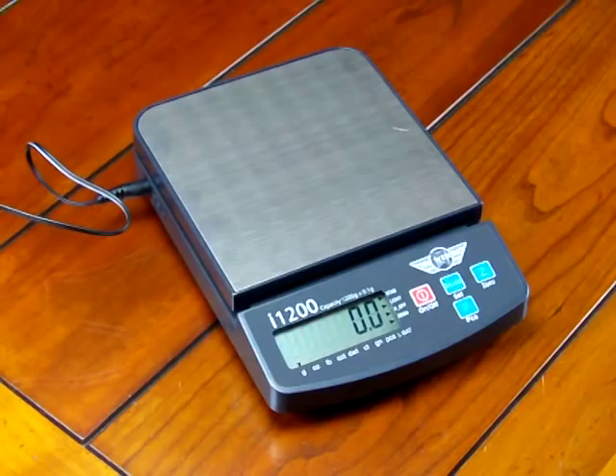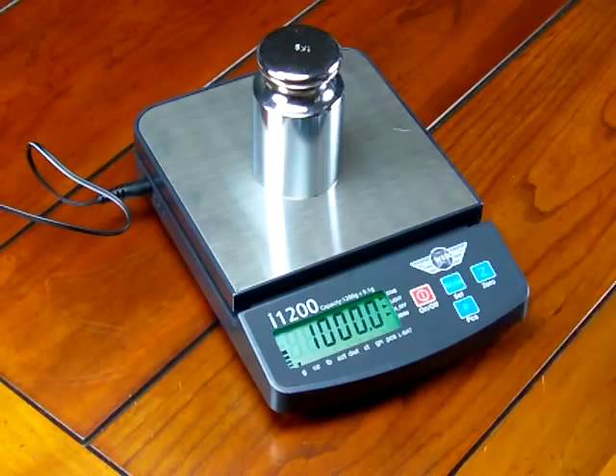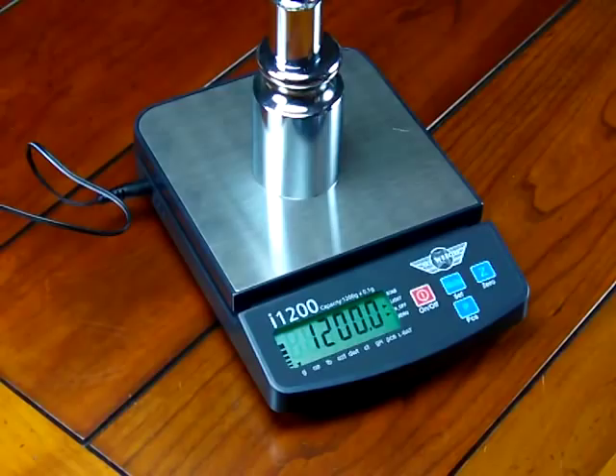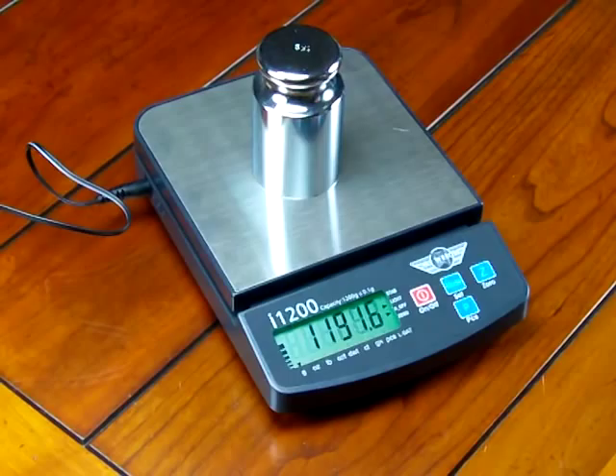A couple more features I'd like to show you: on the left-hand side of the display we have a weigh meter. You'll notice this weigh meter goes up as we increase the weighing capacity. Here's a 200 gram weight — you'll notice the meter goes higher and higher. It gives an idea to the person using the scale how much weighing capacity is left.